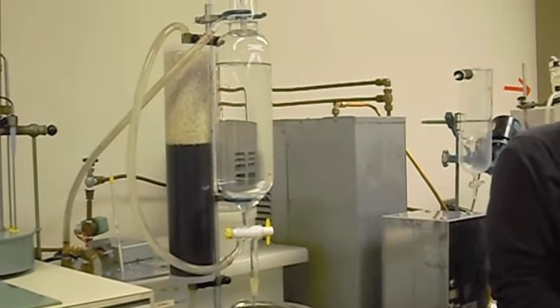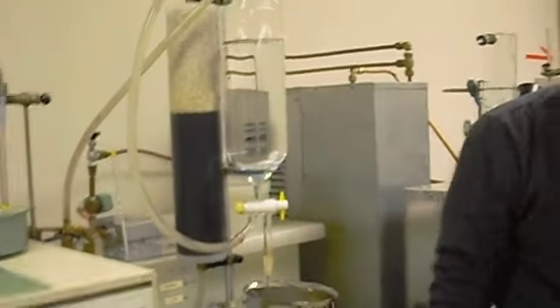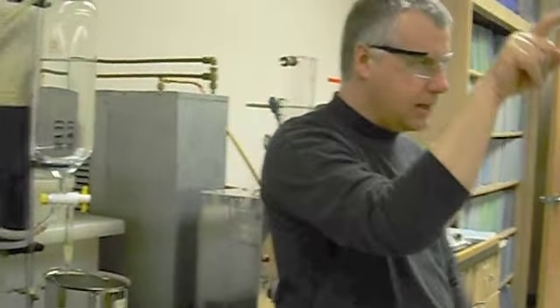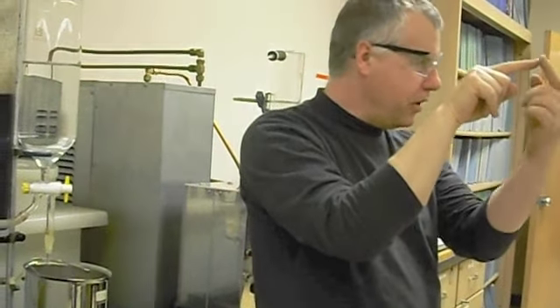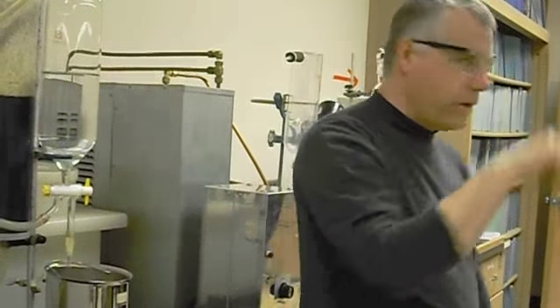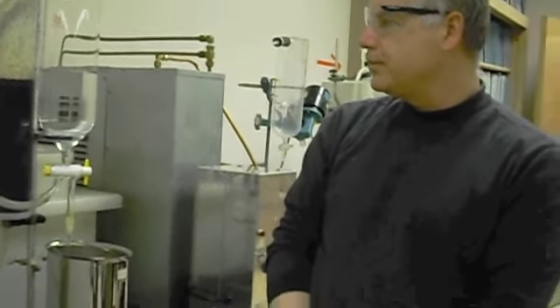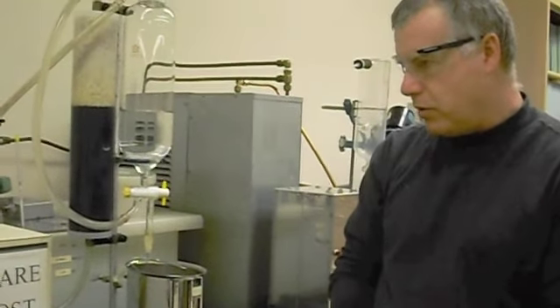And that works to a precise volumetric level because of the way that little point sticks out. So when the water turns off, it pretty much just comes to a reproducible sort of meniscus on the end there. Gives you a good charge of water that you can more or less reproduce.